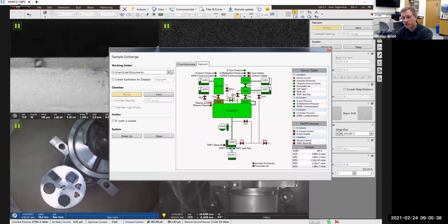When you start using electrons, you pretty much get rid of that limitation, because if you consider the electrons as a wave, we're talking about such a small wavelength that it doesn't become the bottleneck anymore. The wavelength of the incident signal we use to image is not an issue anymore. What becomes an issue is really the way the system manipulates those electrons to form an image.